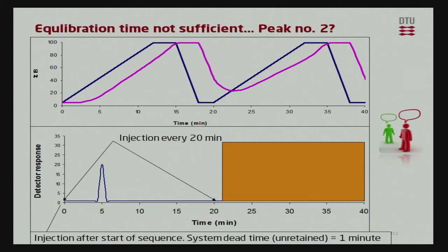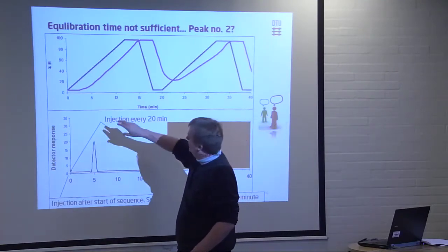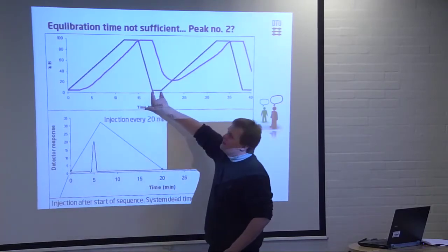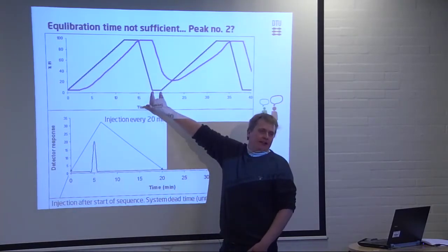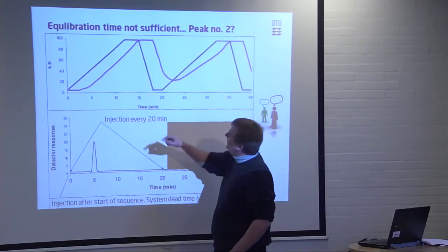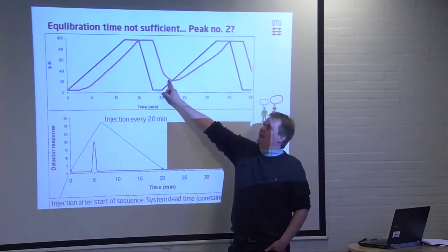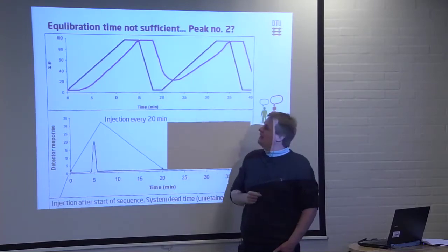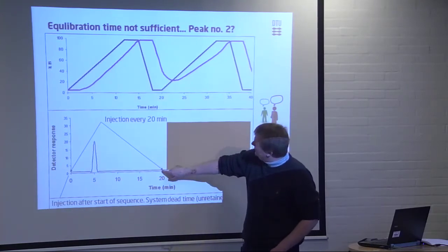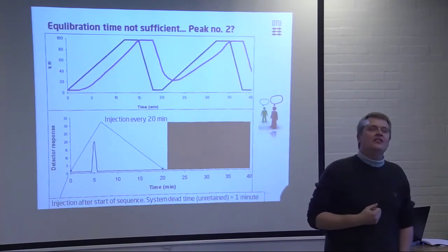And, you have another small assignment here. So, let's say that you programmed it in, and you say, well, I just need two minutes for it to equilibrate after the gradient, and then I'm happy. Then what you really get is this purple curve. So, you can also see we don't get down to the percent organic we think we get, and what do you think happens? If we inject it again here, 20 minutes, here, and we are here, what would happen? We will have good retention of our analyte. No.